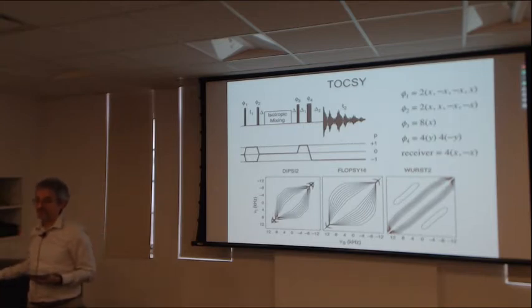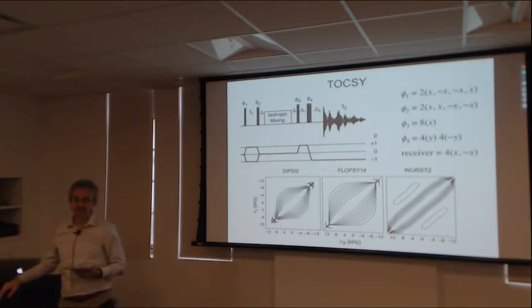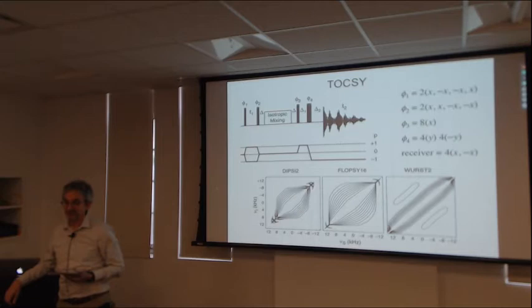The problem is, what signal do you eventually measure? If you want to detect hydrogen at the end of the day, then typically one might relay the magnetization down to the amide hydrogen, dissolve the protein back in water, and detect on the amide hydrogen.